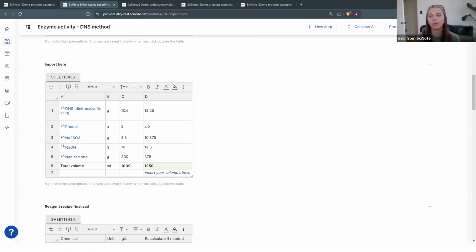Okay, so this one's a long one, so I'm going to read it. Just bear with me here. How do we manually extend the length and width of the table? In our usage of the new tables, they default to the thin width, which then requires scrolling to see all the cells in the table. Additionally, when printing protocols, the tables will also revert to the thinner format, causing the tables, which should be about a quarter of the page in length, to print as 2 pages in length.